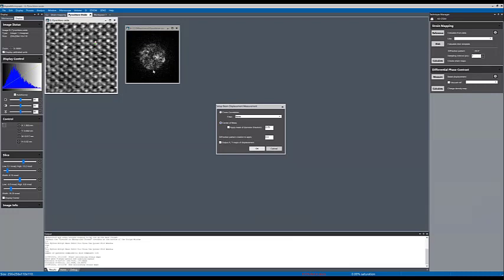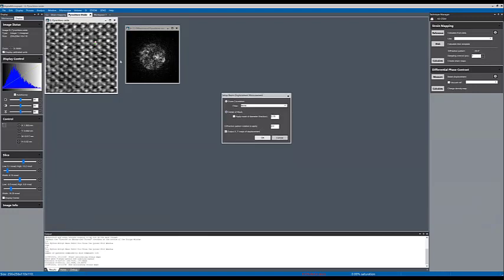So I would say if you have magnetic samples, and you want to measure how much the beam is moving, the center of mass more, for example, similar to what I'm showing here. If you select center of mass, you can apply a mask diameter so that if you have some noise, or you have other disks or other reflections here in your image, you can mask them off by applying a mask.